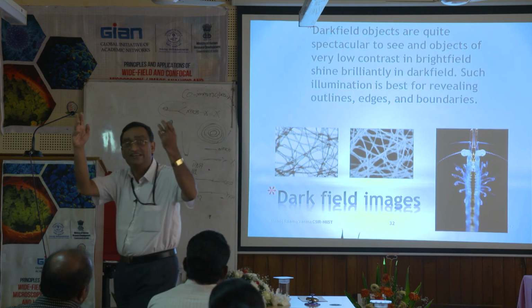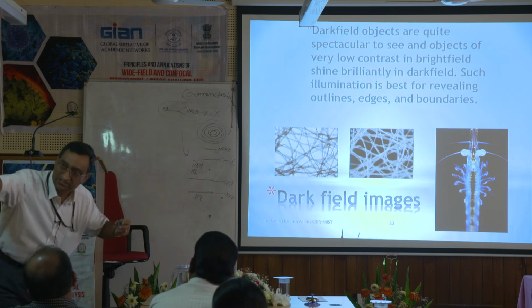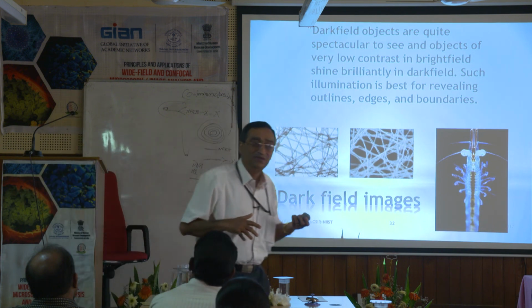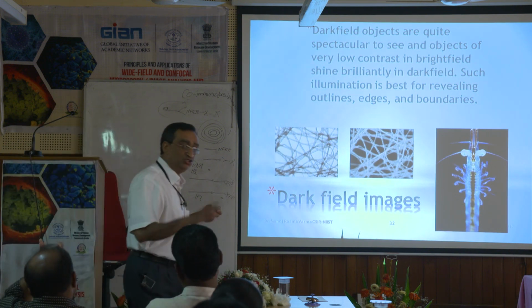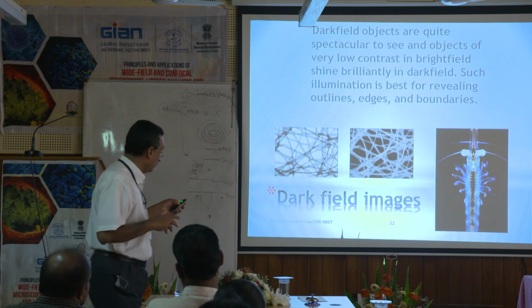Instead of having direct light, you use some lights at some hidden points and then take your image. It may look wonderful. I am not an expert photographer, but it may look wonderful. So dark field imaging is a very useful technique.